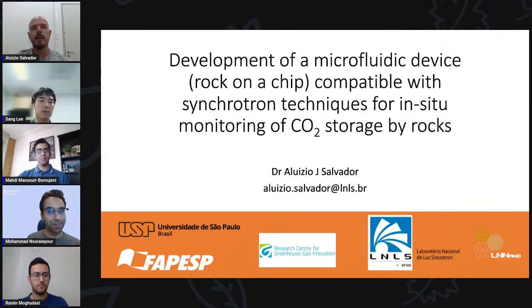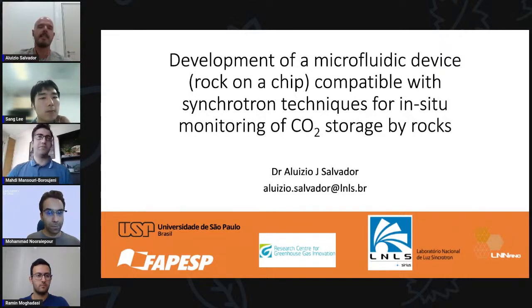Well, as I said, we have the capacity in both the Cateretê, UBA and Mogno beamlines to see nano alterations. As we are planning short experiments, like 7 days for mineralization, we are expecting to see nano changes, like nano mineralization, nano precipitations, or changes in the nanostructure of the pores, not much more than that.